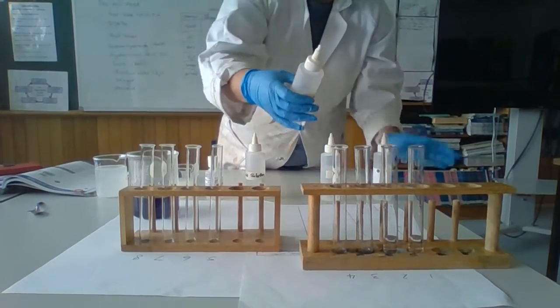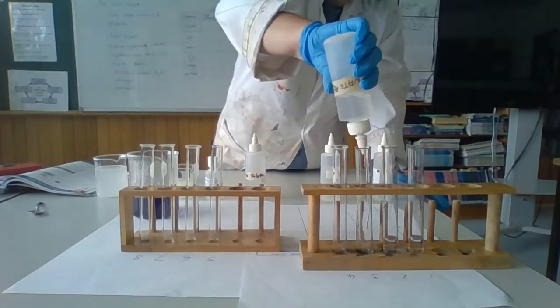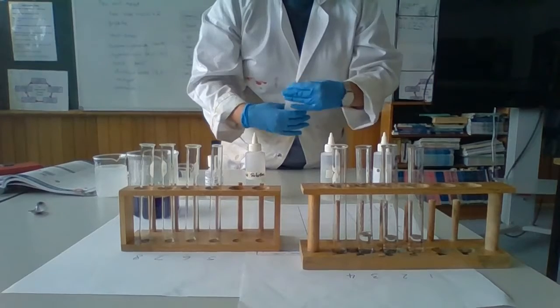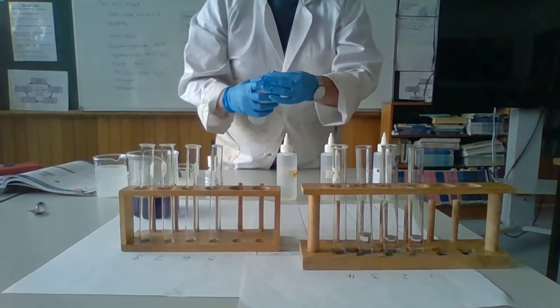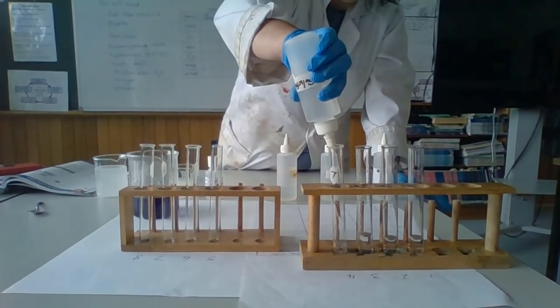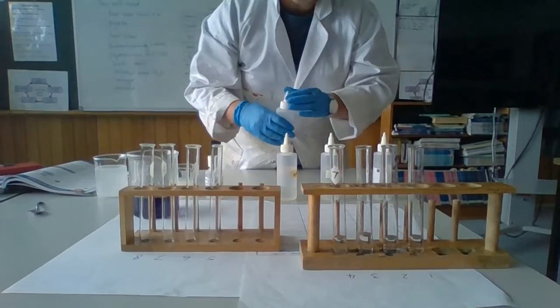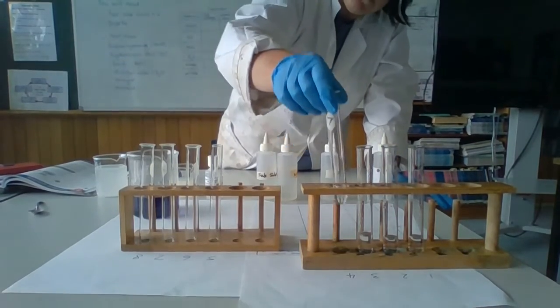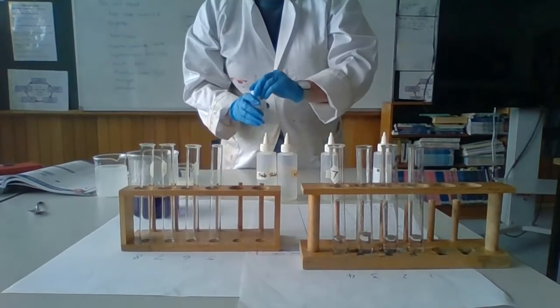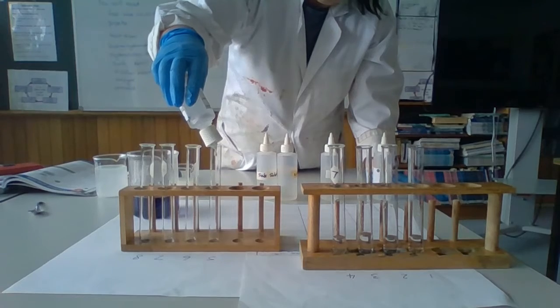Now this is just our water. It doesn't want to come out. There we go, so just normal distilled water. So you can see I'm just putting in approximately a couple of centimetres of each. This is our bleach.